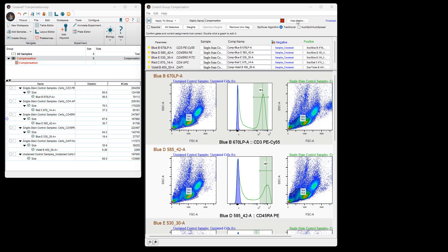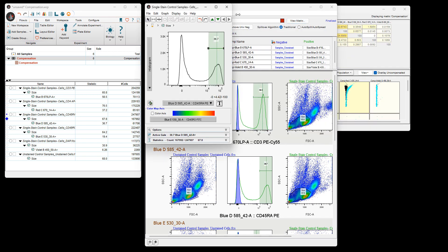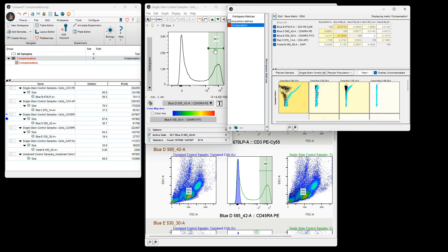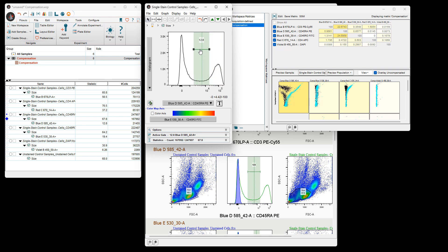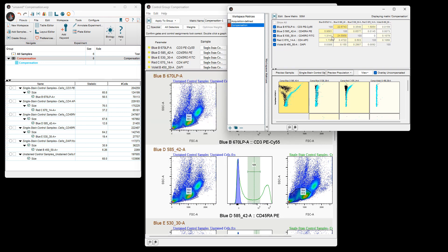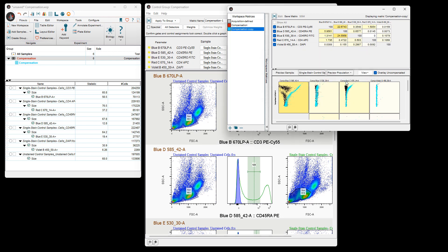To do a final review of the compensation and visualize the compensation and spillover spreading matrix in FlowJo, you will click on the View Matrix button to open the compensation matrix viewer. If changes to the compensation gates are needed, you will click on a plot to open a new plot window, adjust the marker or gate, close the window, and choose Edit, which will create another compensation matrix from your edited markers or gates for use in the analysis. If you'd like to visualize the spillover spreading matrix, you will click on the SSM button.